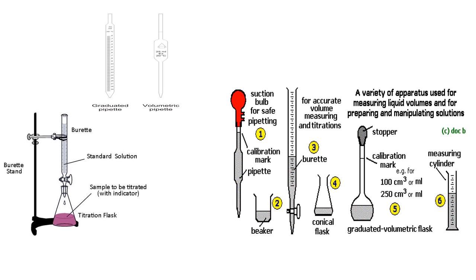The base is normally colorless, but when you pour an indicator, it becomes colored. You see the burette, labeled there. It contains the acid, and the acid will be poured into the base.